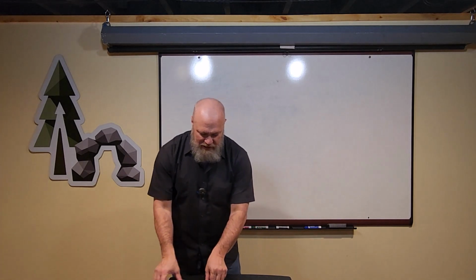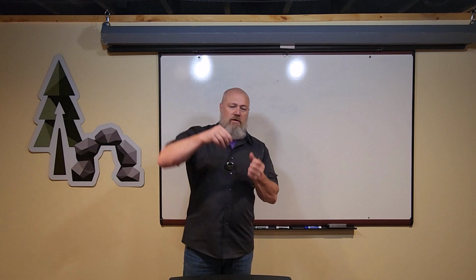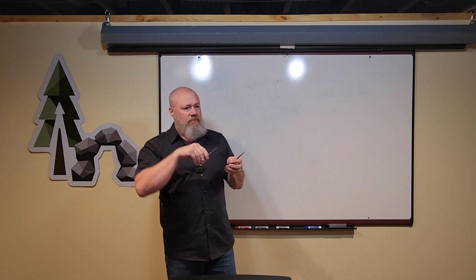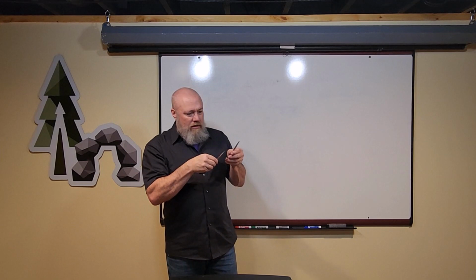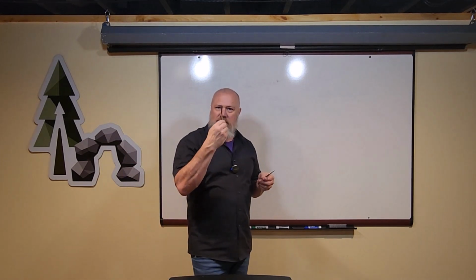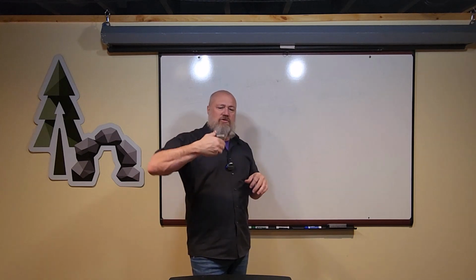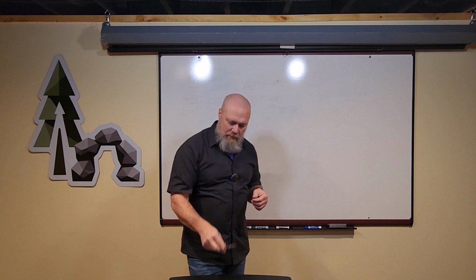Then we're going to get into sharp dissection. You will have a pair of small sharp scissors. These are pointed and sharp, so you're able to get in there and nip little tiny structures, maybe cutaneous nerves or little arterial branches, just little things. Then you'll have a large set of blunt-nosed scissors. These would be cutting through heavier tissue like fascia, tendon, and muscle.